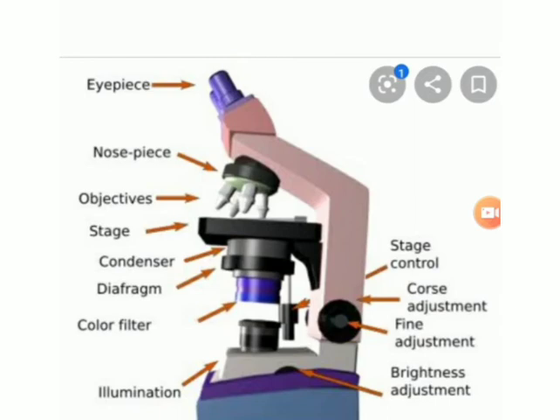We can adjust the brightness through the brightness adjustment knob, located on the right side of the microscope, to increase or decrease the light on the stage.